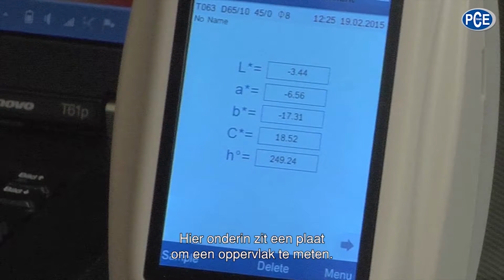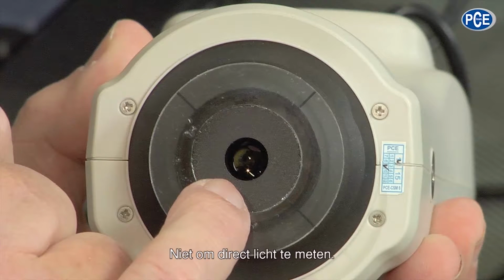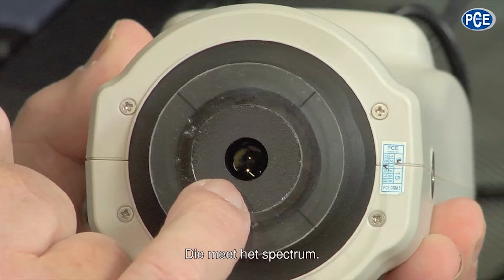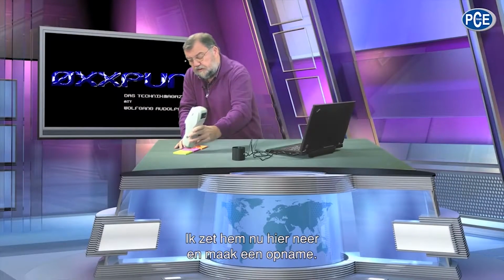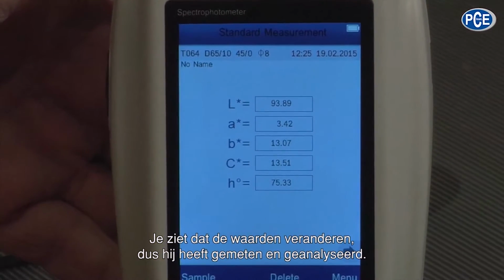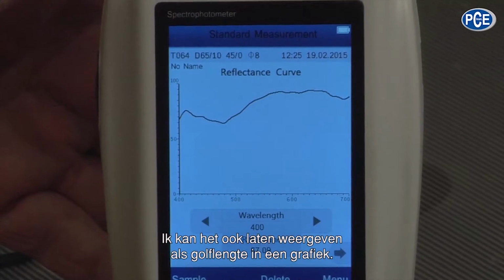Here at the bottom it is placed on to measure a surface, and not for light directly. And as you can see here, here's the plate where it is put down on, and inside you can find the sensor, which records the spectrum. Then the electronics work. When I put it down on here now and make a picture, you can see that the values change, so it has measured and analyzed. I can also let it be shown over the wavelength as a graph.